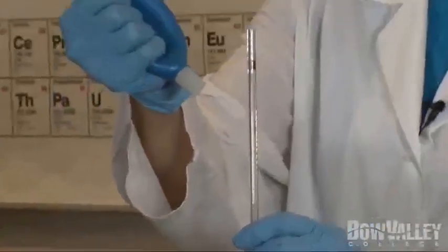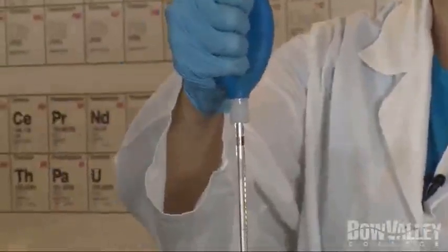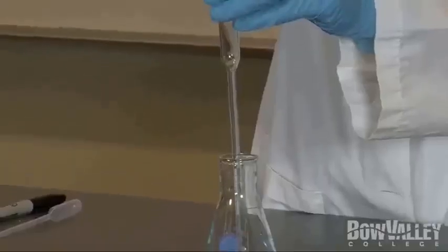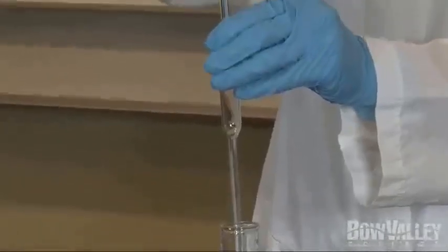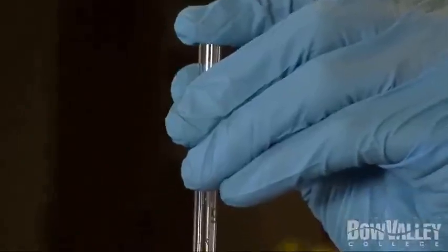Squeeze the pipette bulb, then securely place it over the end of the pipette. Slowly release your grip on the bulb and allow the liquid to rise up the pipette. You should allow the liquid to rise above the line marked on the pipette, but stop before the liquid level reaches the bulb. Remove the bulb and quickly cover the end with your index finger, creating a seal.